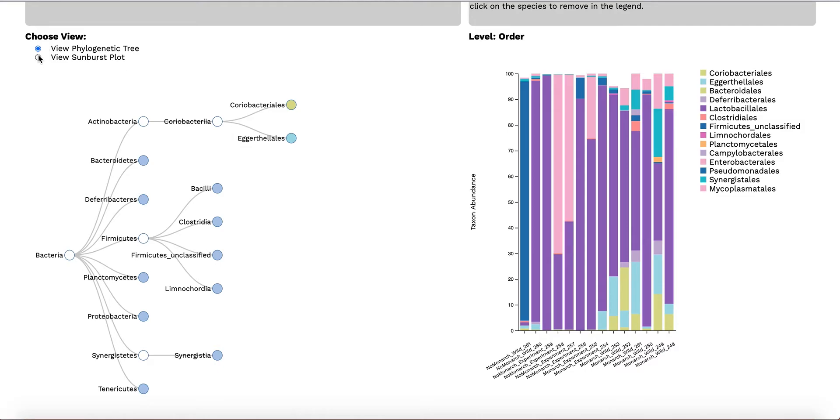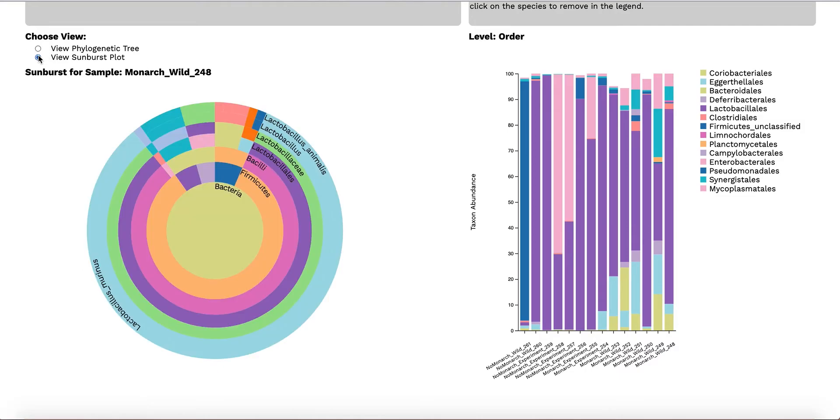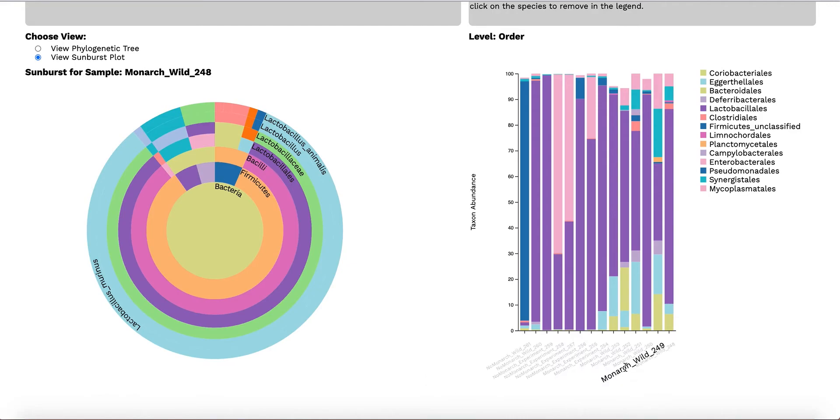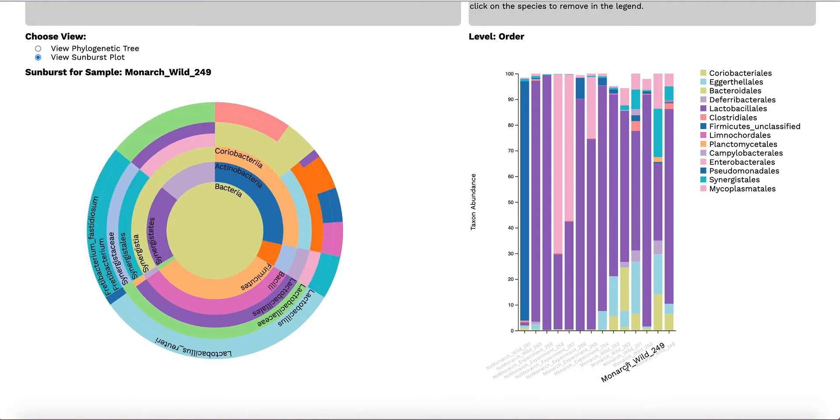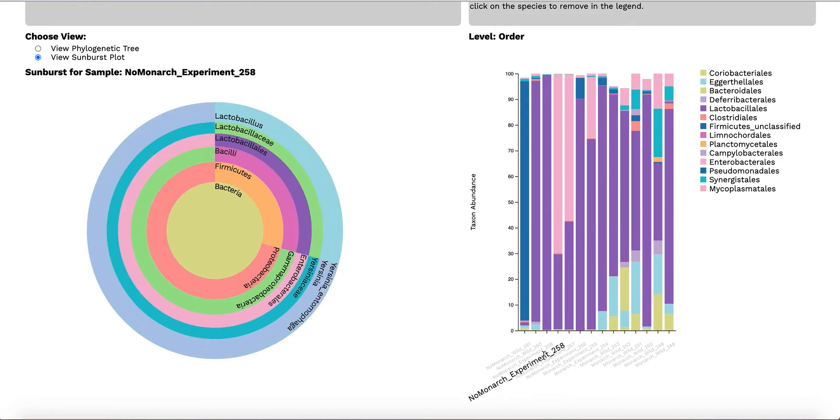Selecting the sunburst view allows the user to see the different species present within one selected host sample. You can choose which sample to look at by clicking on the sample name in the bar chart labels. We can clearly see that monarch has more species diversity compared to non-monarch.